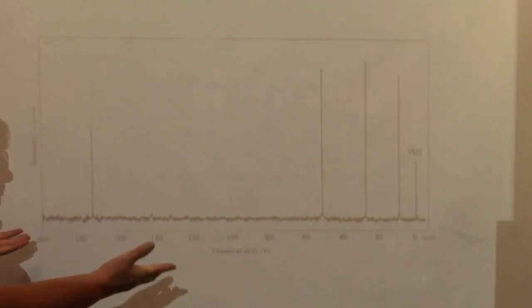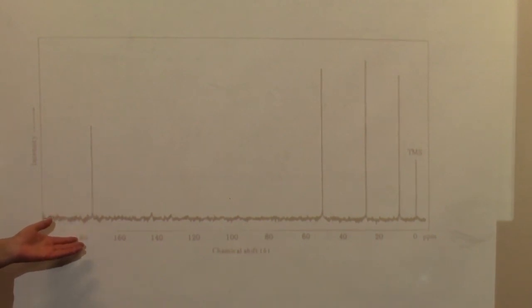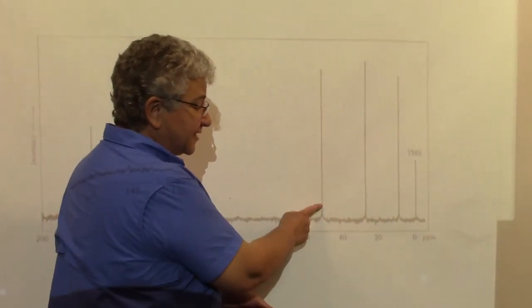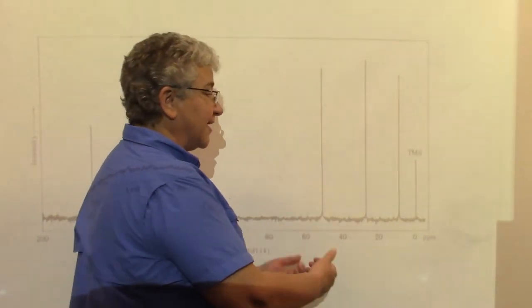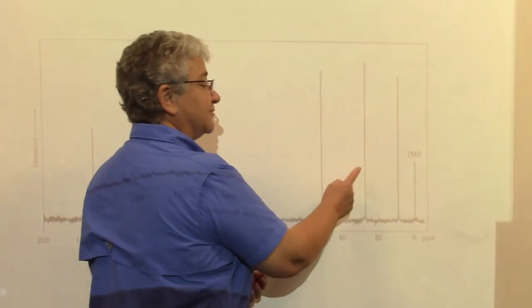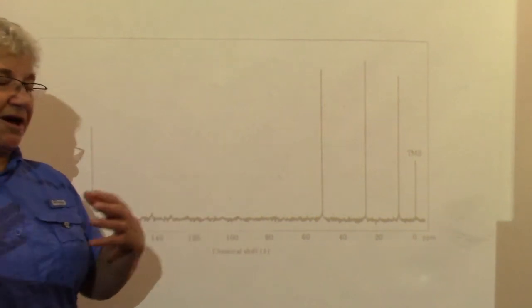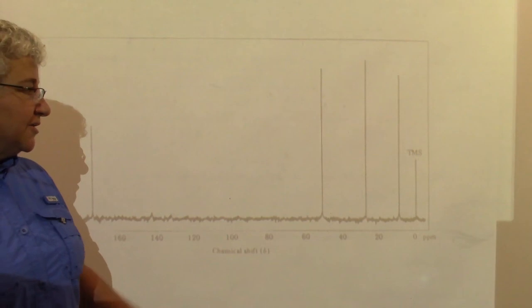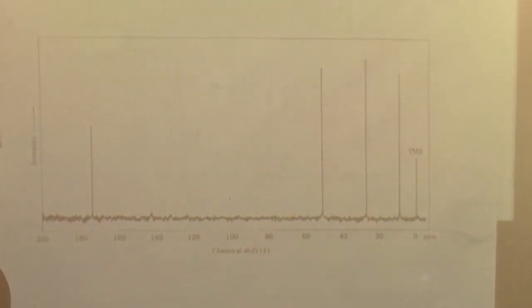And if I were to describe this spectrum, I would say that I have 3 peaks that are upfield and 1 peak that is downfield. But I could talk about these two peaks and say that this peak is downfield from this peak, right? Or I could say this peak is upfield from this peak, right? And so we just use those words to talk about the spectra relative to a chemical shift. So that's downfield, upfield, your TMS internal standard, your axis.